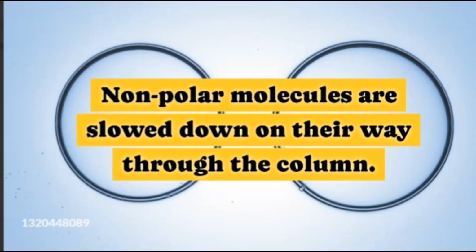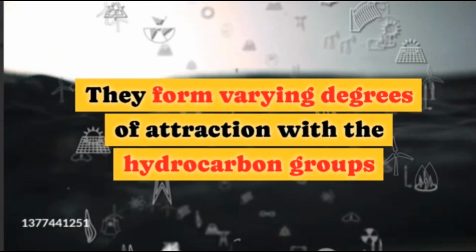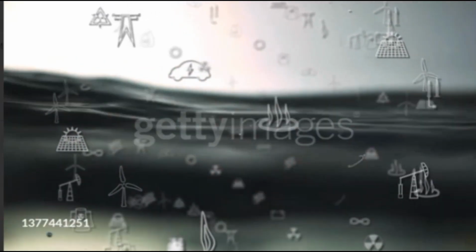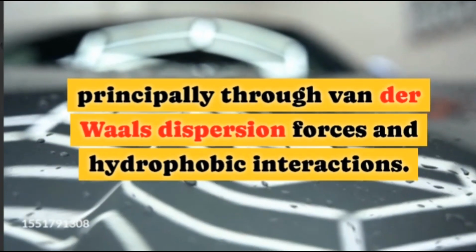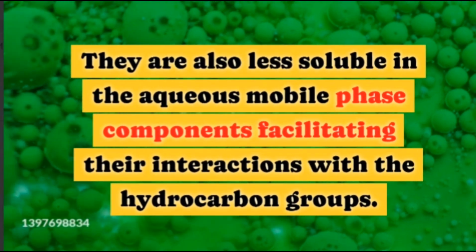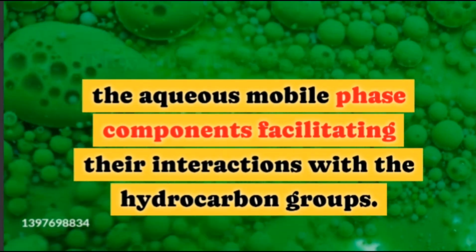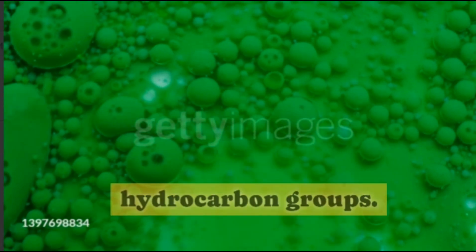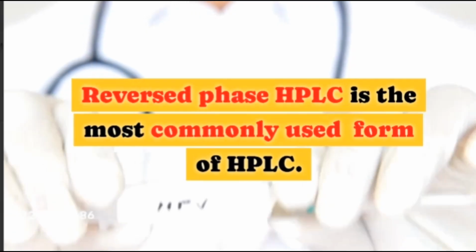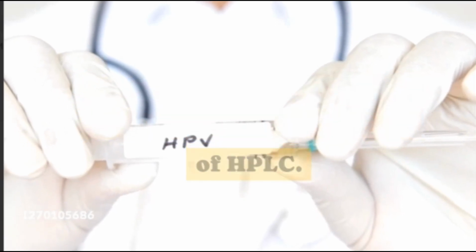Non-polar molecules are slowed down on their way through the column. They form varying degrees of attraction with the hydrocarbon groups, principally through van der Waals dispersion forces and hydrophobic interactions. They are also less soluble in the aqueous mobile phase components, facilitating their interactions with the hydrocarbon groups. Reversed phase HPLC is the most commonly used form of HPLC.